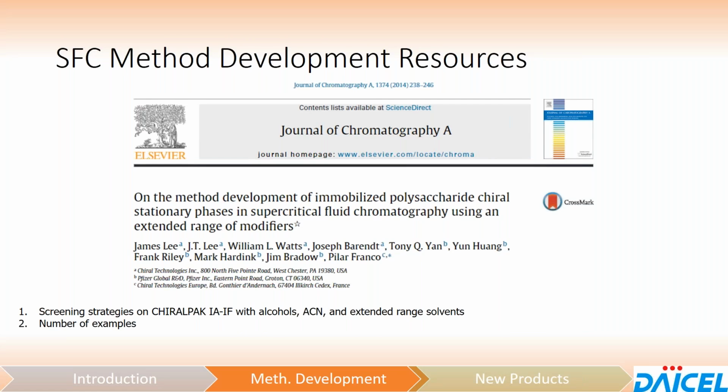A resource for you. This was published a few years back, particularly exploring the use of those extended range solvents. This was done in collaboration with Pfizer up in Groton, Connecticut. Some interesting strategies for screening on the immobilized CHIRALPAK line. We did not have IG through IJ at that point, so this is only including IA through IF.